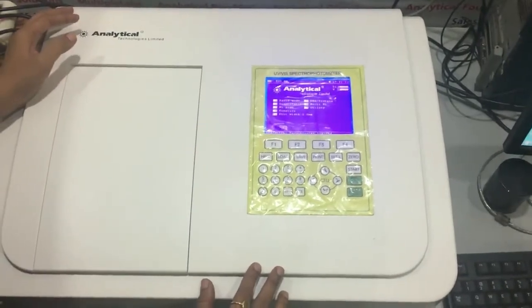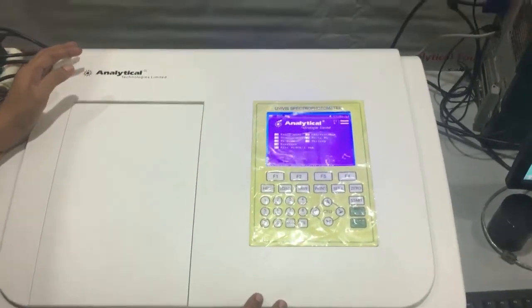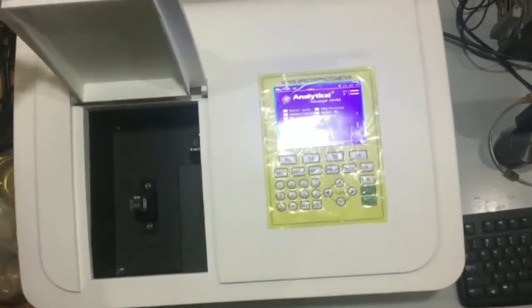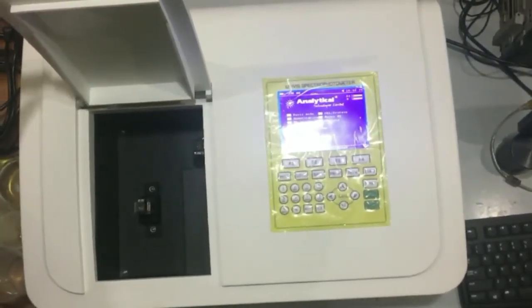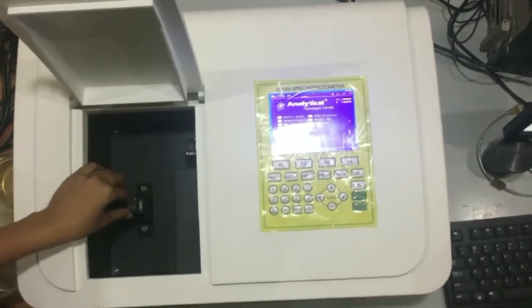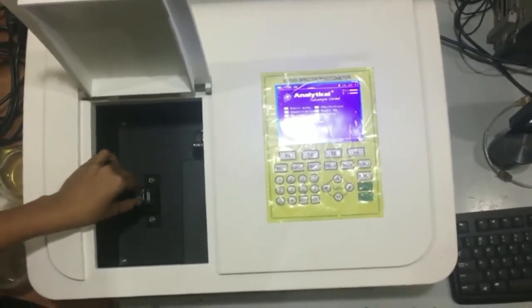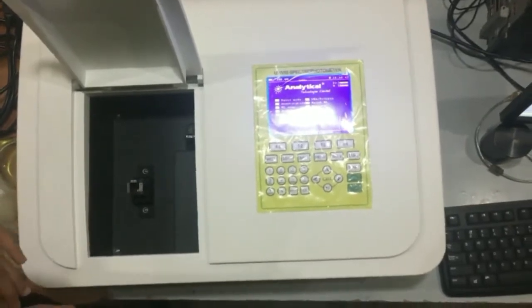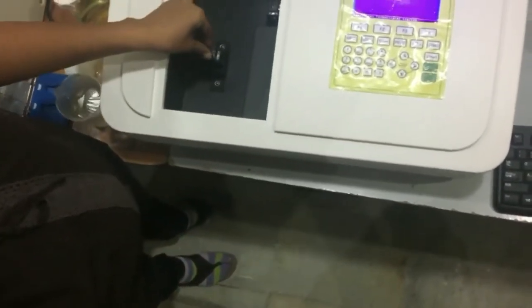Before analysis of any absorbance or transmittance, in the sample window you can find two different cuvette ports. One is fixed for the standard reference and the other port is fixed for the sample. The cuvette needs to be kept in a position so that the transparent surface of the cuvette faces the lamp source, like this.